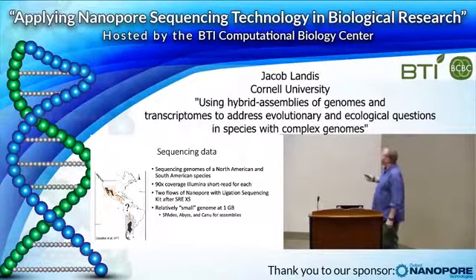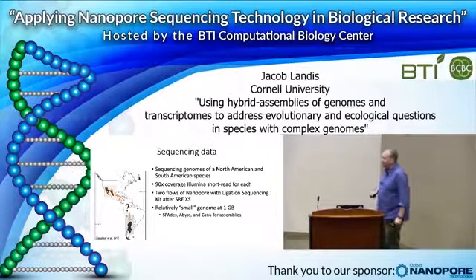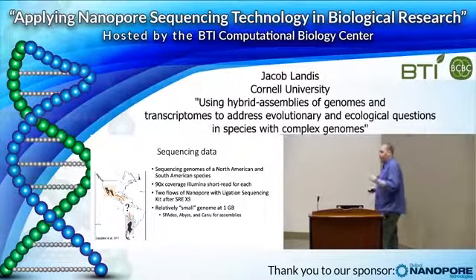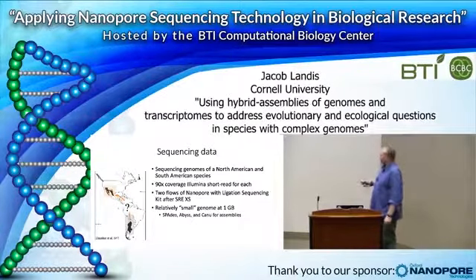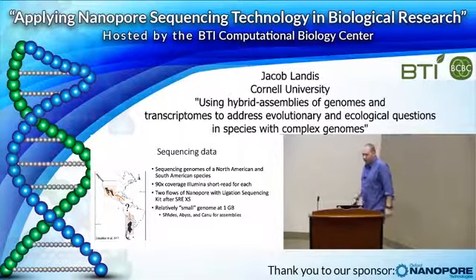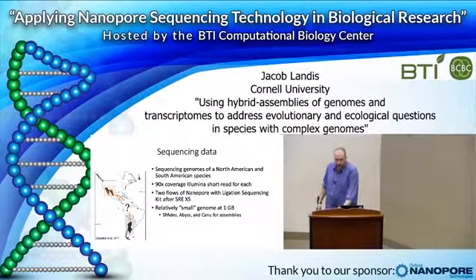We will be doing the SRE XS, so it removes some of the really small reads, but not a bunch of them. We don't have a ton of material, especially for the South American species. And we'll try some of the different assemblers, SPAdes, ABySS, Canu, to see how things go.